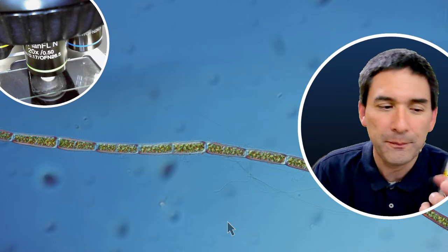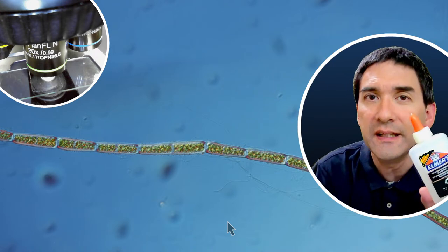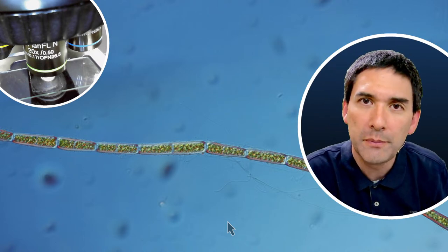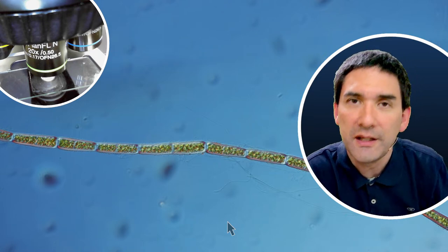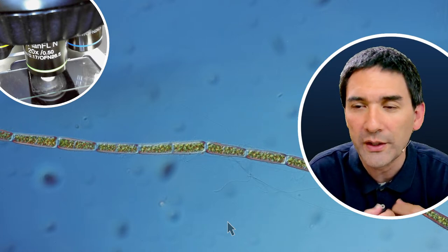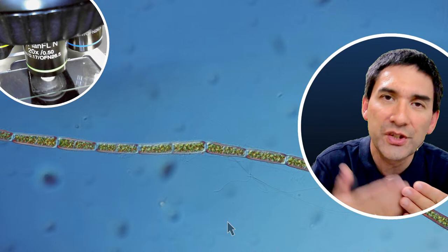But then again, it might not be suitable for all specimens, because it's always a question of the refractive index. This is the reason why there are different mounting media available, for the different specimens, depending on what you actually want to see. And that's why we've seen that in some cases they don't work quite well, because the mounting medium has a refractive index which doesn't match the specimen, and therefore you do not see all of the details.